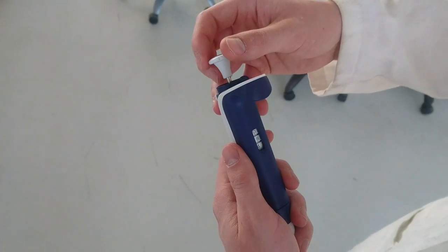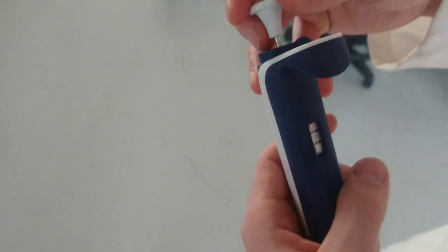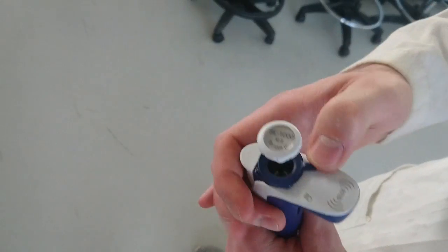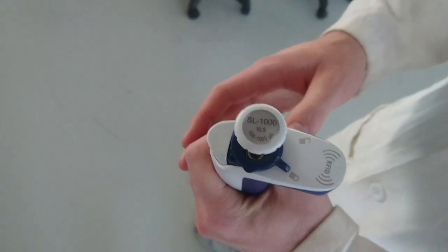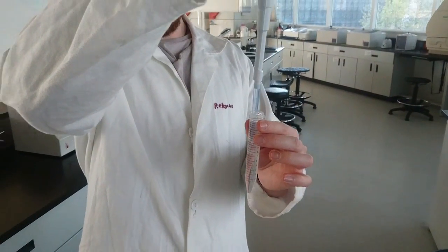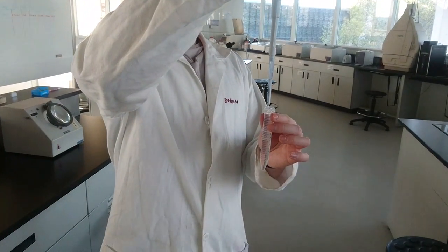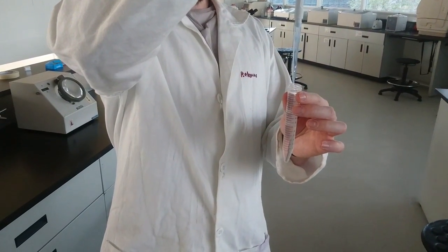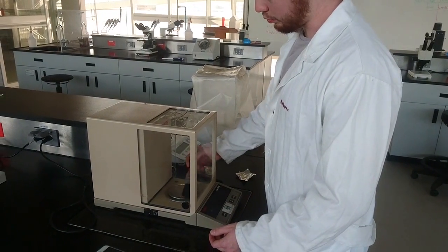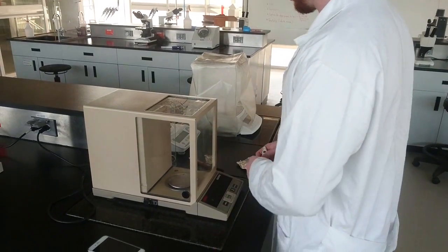In the first activity, measurements were made using the micropipettes: 10 measurements at a minimum volume, 10 at an intermediate volume, and 10 at a maximum volume. Subsequently, aluminum foil was formed into a container and placed inside a balance, which was tared, and the volume measurement was deposited with the micropipettes P20, P200, and P1000.